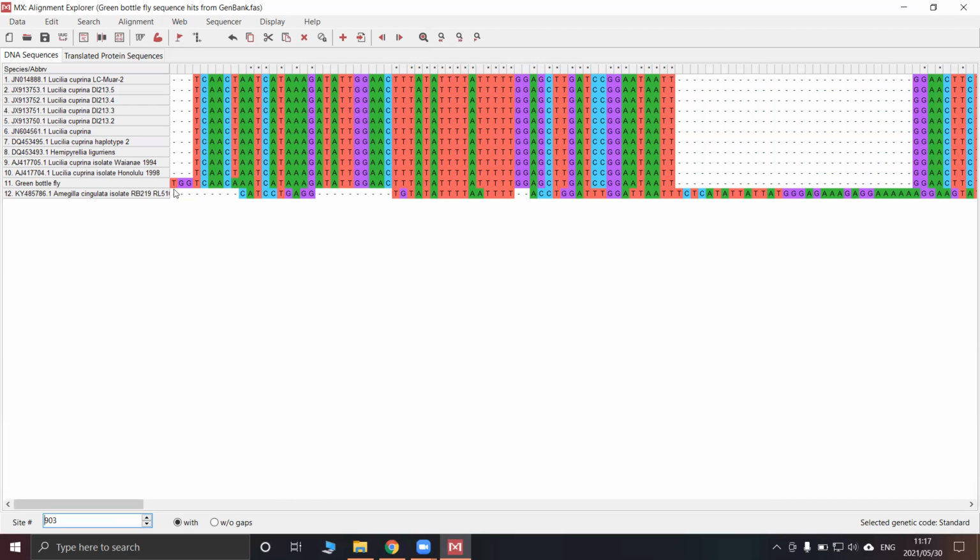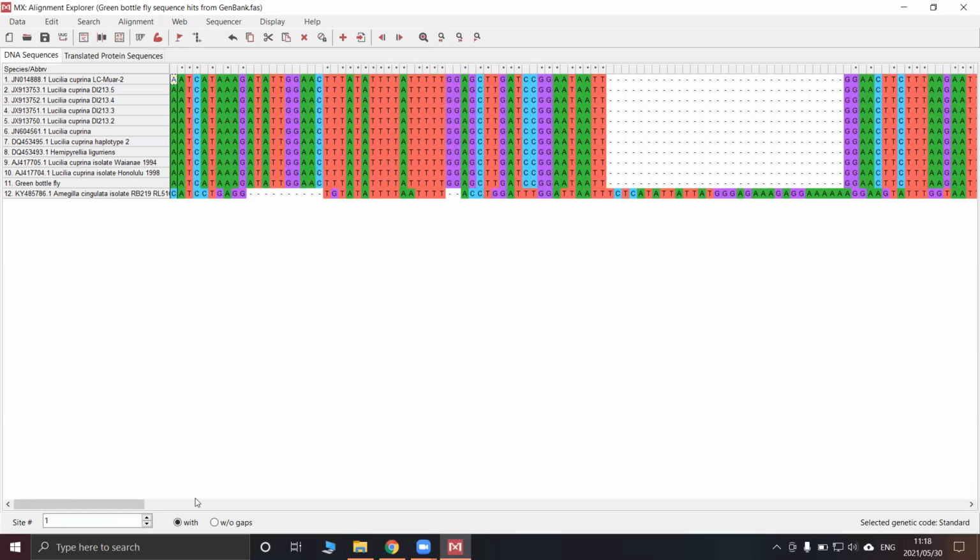They're at the beginning and at the end. So here we see from this point, if I hold Shift and click, the region highlighted in yellow has regions where there are gaps. And we want to delete these regions so all of them start at a point where a nucleotide is basically occupied. So I have selected the region of overhang and I'm going to delete it by just clicking delete.